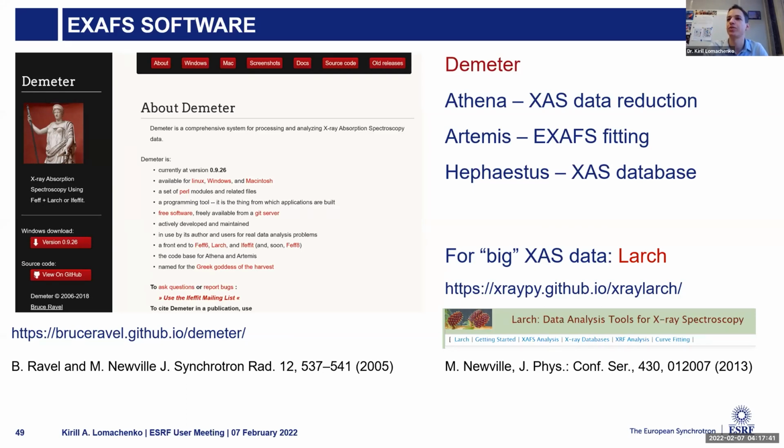So when you have big data, a lot of XAS spectra, one of the most widely used software is Larch, coming from Matt Newville from Chicago. Basically it's a Python environment that can be used as standalone software, or its modules can be used as Python libraries.